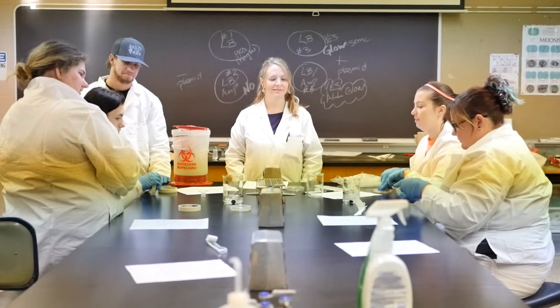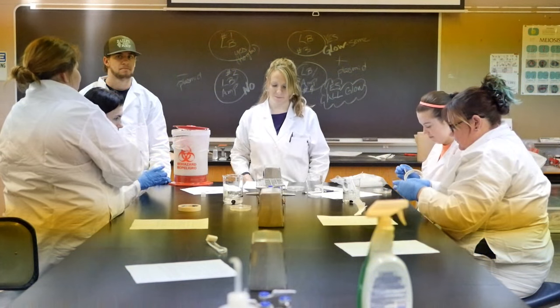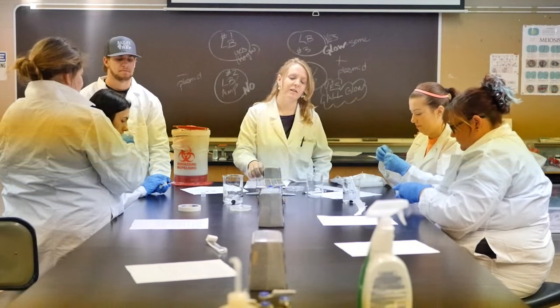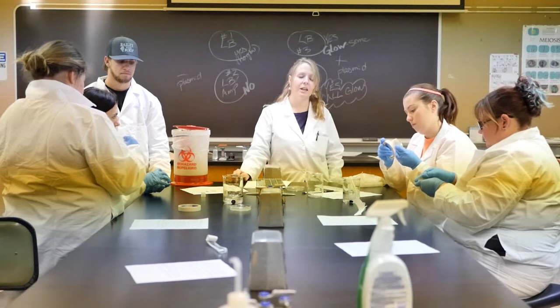Can I have some tape, please? There you go. Thank you. Like a nice little bacterial Christmas present. Except these will not be opened again. So we're taping these up to get them sealed, so we're not going to be able to open them again once we've got a lot of bacterial growth in there. We don't need to get back into it again.